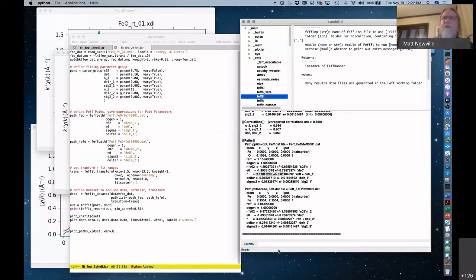Redoing the potentials calculation, we really have to redo the potentials because the structure changes dramatically. I think you have to rerun, and that can take seconds instead of the milliseconds or microseconds to calculate the path contribution. So we don't have any of that automated yet.